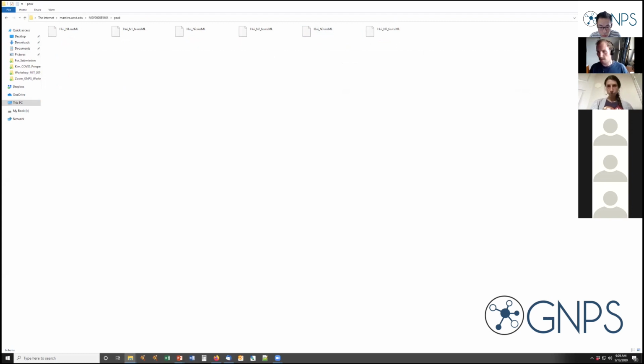So, and that makes especially sense when you have large data sets. I mean, for this one, I think the way Allegra showed you is totally legit, because it's just 6 files. But if it's like 200, then obviously you want to have this in a faster fashion. I'm not sure for Linux or Mac, but then you can use an FTP client such as WinSCP.